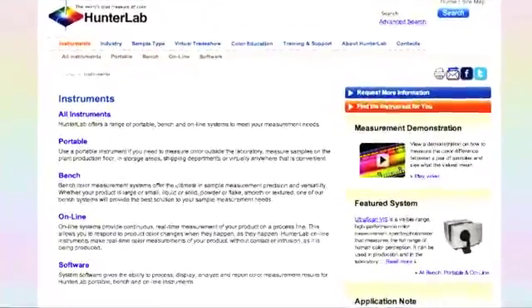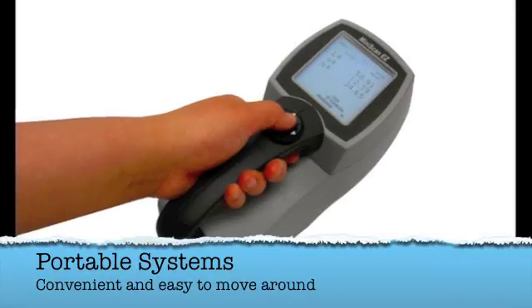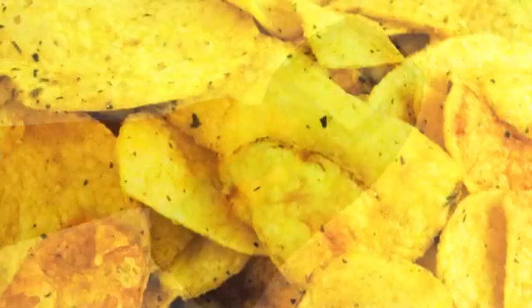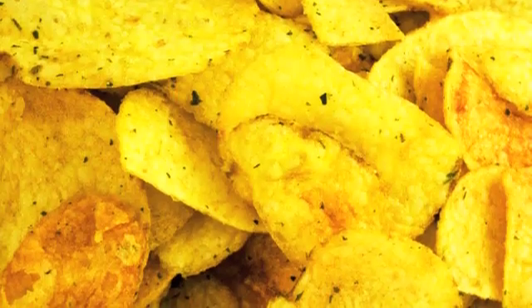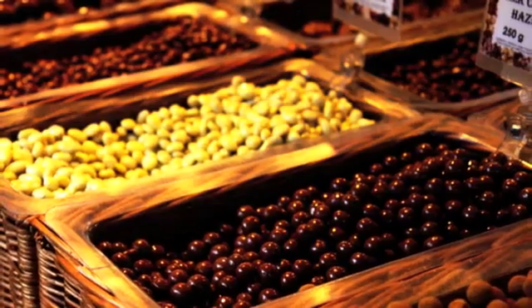There are three main categories of instruments. First are the portable systems, which allow you to measure color wherever you need. Run by battery power, they give you the ability to measure samples directly on the production floor, in storage areas, shipping departments, or anywhere else you can think of.